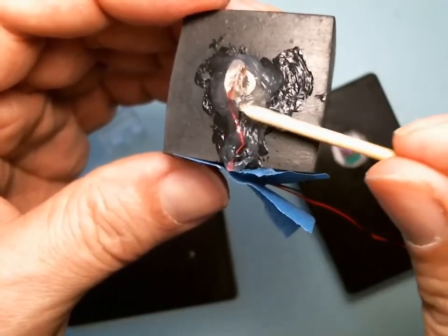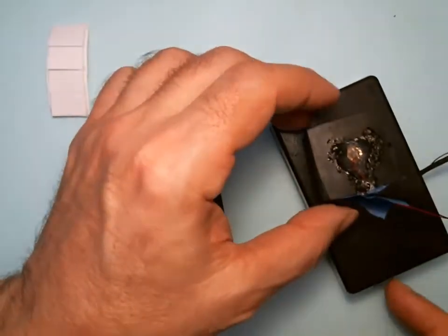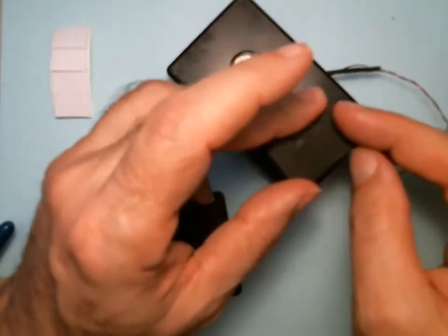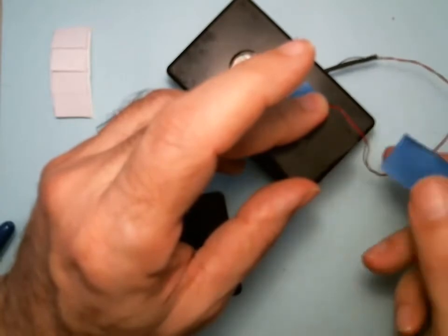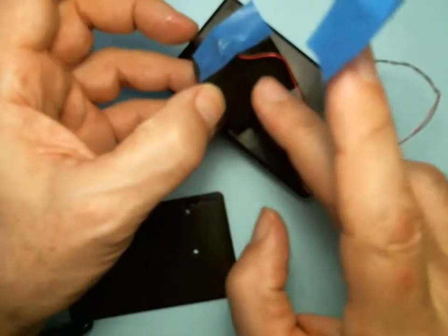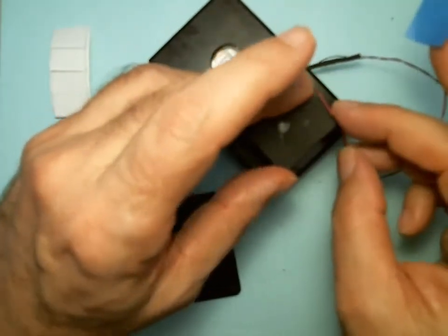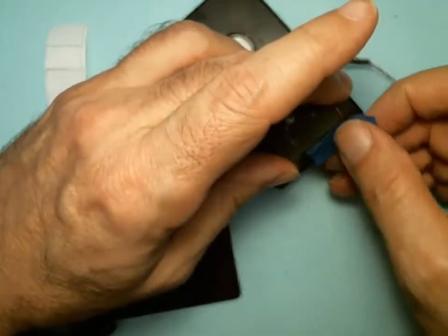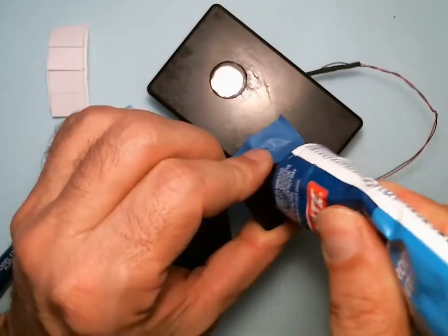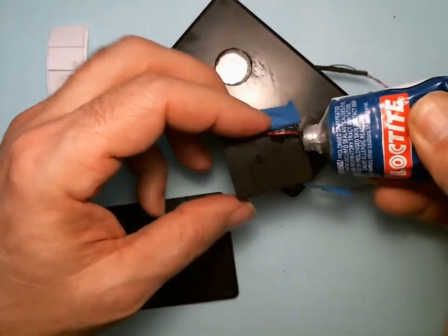We're going to let that dry overnight. Now I fold the wire over to the side because I want the wire to come down the edge — so when it lays down I'll have all this area available for my hinge. I make it bend to the side and then down the edge, and I'm just going to tape it in place.